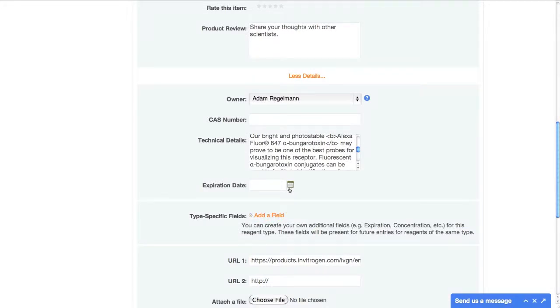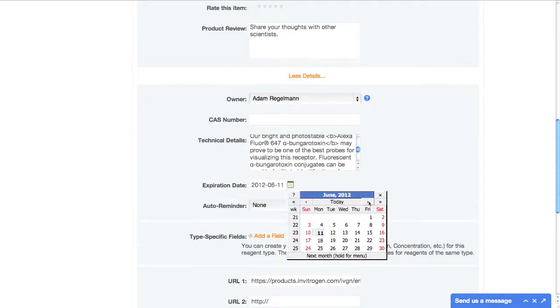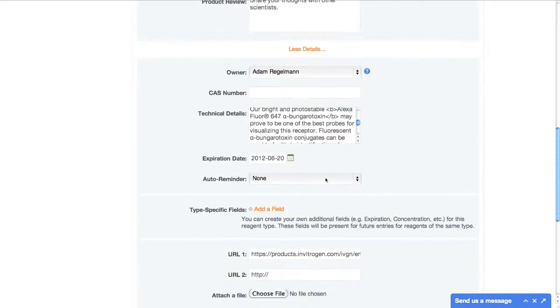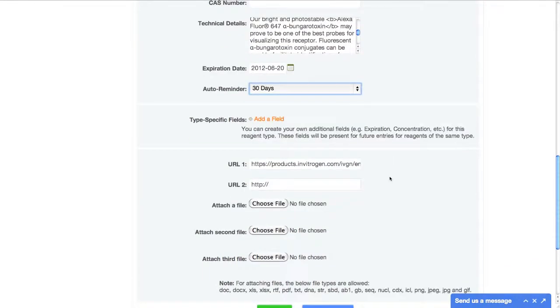Just like milk and lunch meats, research biologics and chemicals have expiration dates. With Quartsy, you can easily input the expiration date, and you can have the system send you an email reminder 30 days beforehand, so you don't accidentally use expired antibody on that important western blot.